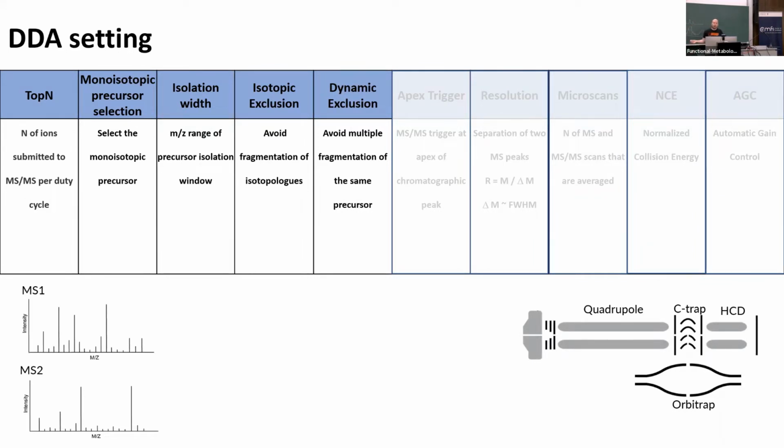You only need ideally, well, let's say 2, but 1 is already fine, right? Ideally, that should be at the top, which we get to at the next one. But over and over triggering of the same MSMS is basically wasting scans.